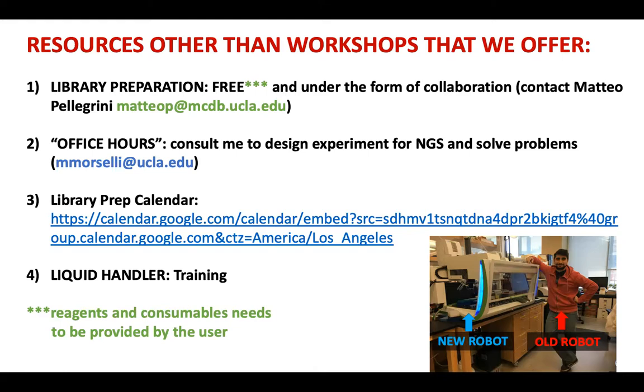Also, I don't know if I mentioned in the video, the TapeStation is available for everyone at UCLA campus. If you want to use it, of course, you have to buy your own reagents and consumables, but just write me an email, and then I'll send you all the reagents that you need with the catalog numbers and how to schedule a run, okay? I have to update these slides.